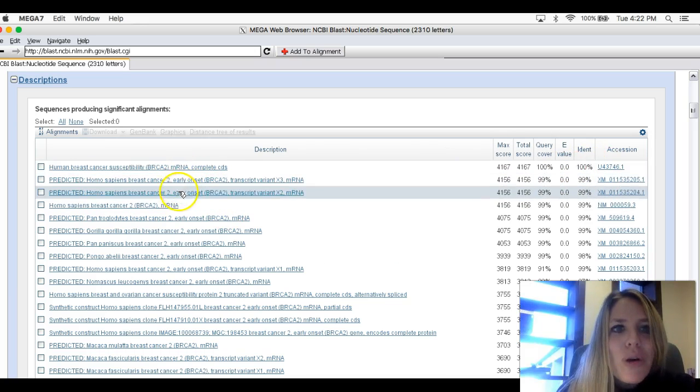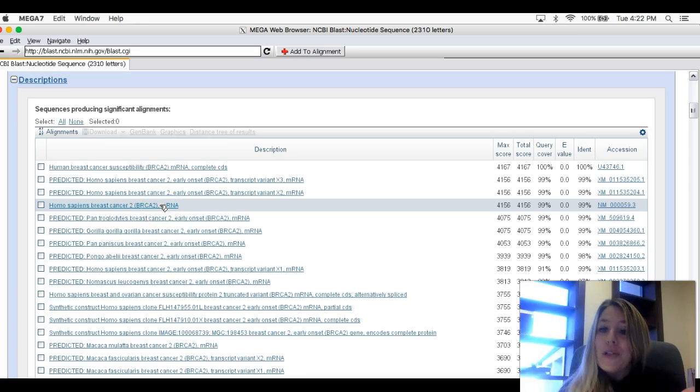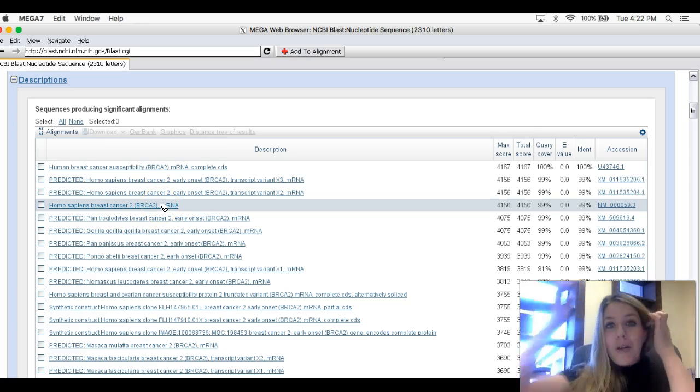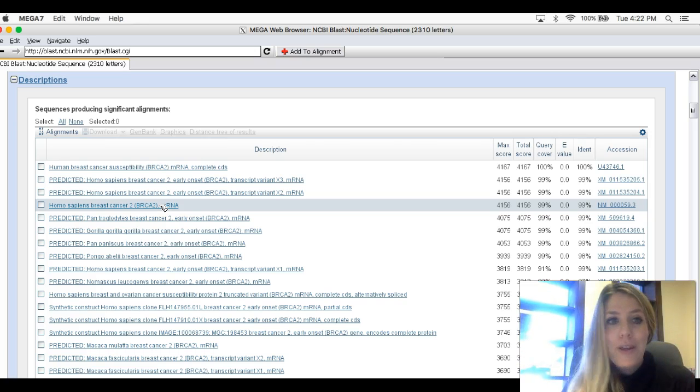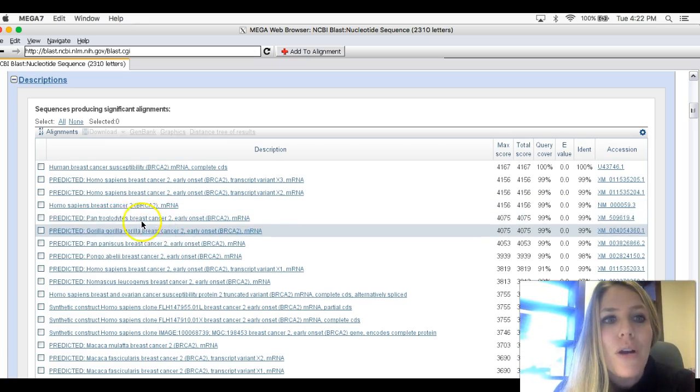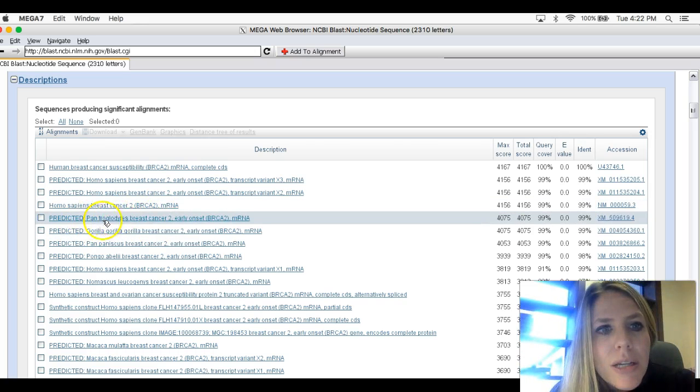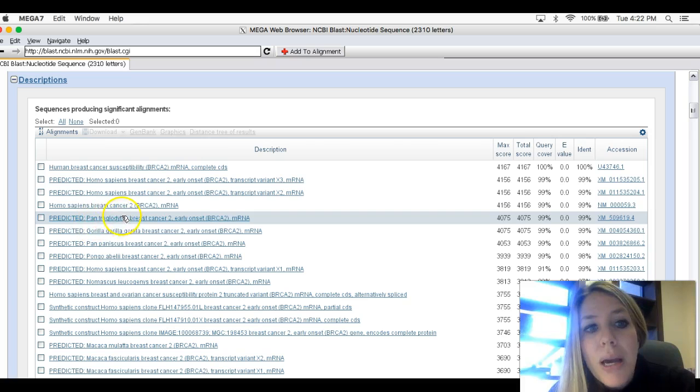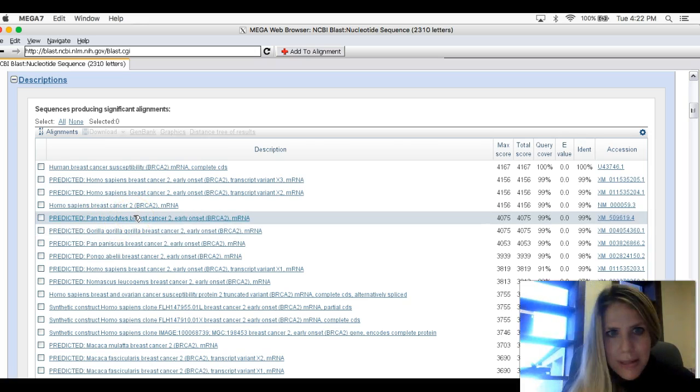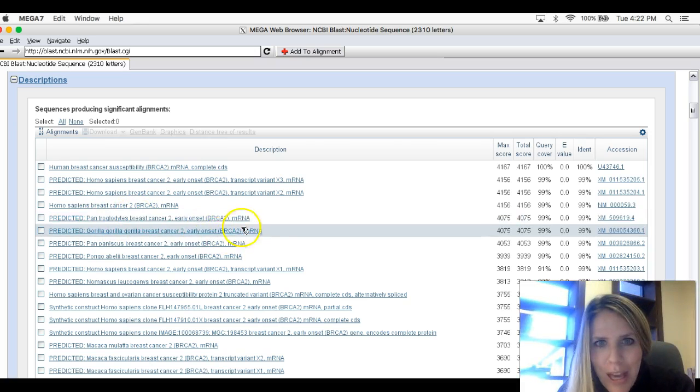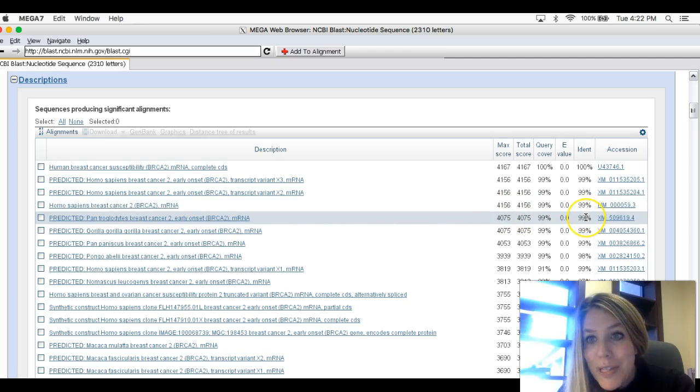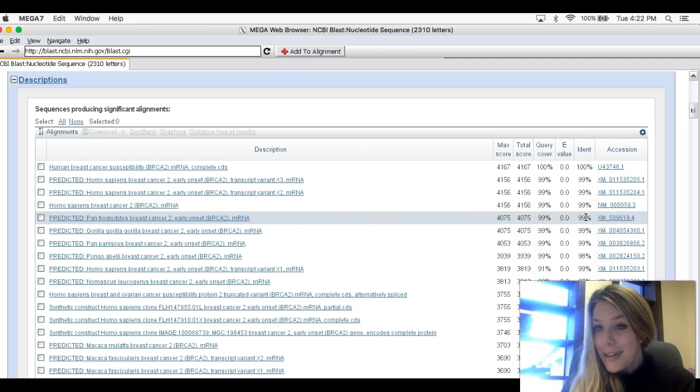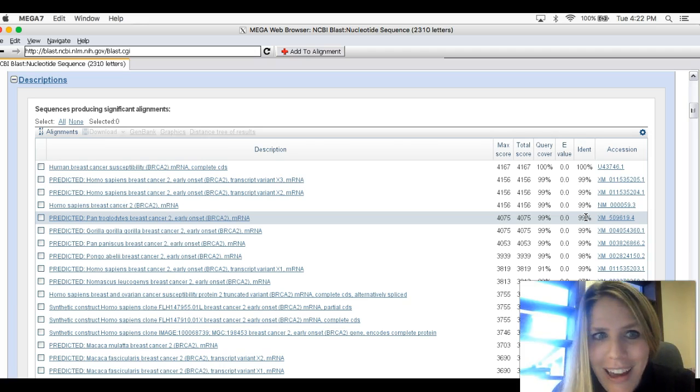The next few are also humans. Skip over those because we're drawing an evolutionary tree. We want to see how things other than humans compare to the humans. So skip over other humans. The next one on here, in my case, is Pan troglodytes. That happens to be a chimpanzee. And if you look at his identity, it's 99% genetically identical for this gene to the human. How cool is that?